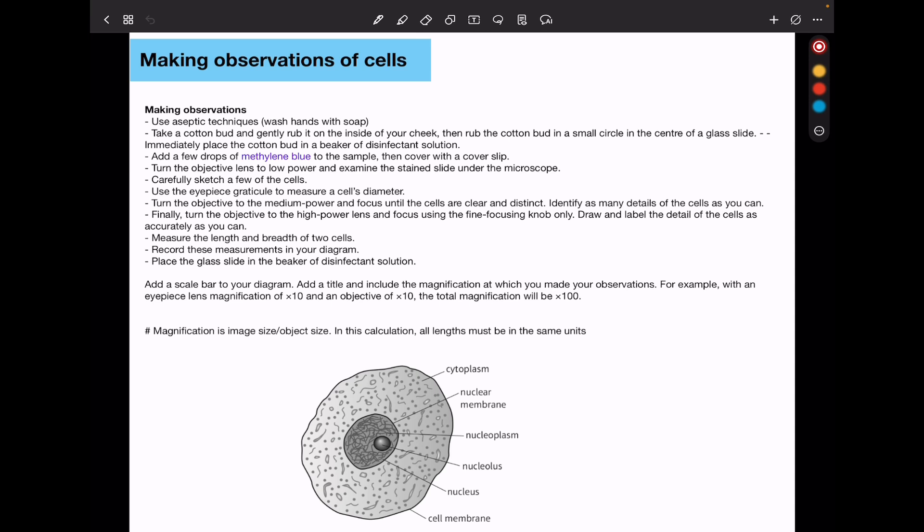And finally, you can turn on to high power and focus using the fine focusing knob. Draw and label the details of the cells as accurately as you can. So you could also measure the length and the breadth of the two cells. Maybe there are two cells you're observing. Recall the measurements in your diagram. Place the glass slide in the beaker of disinfectant solution.